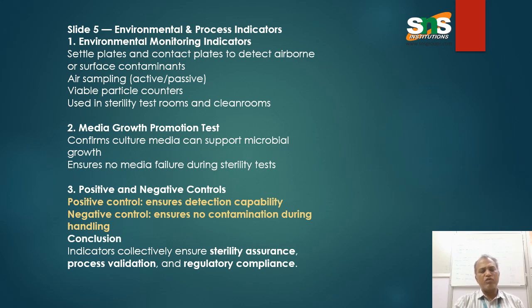Next, media growth promotion test. It confirms that the culture media can support microbial growth. Thereby it ensures there is no media failure during sterility testing. That is the main advantage of the media growth promotion test.